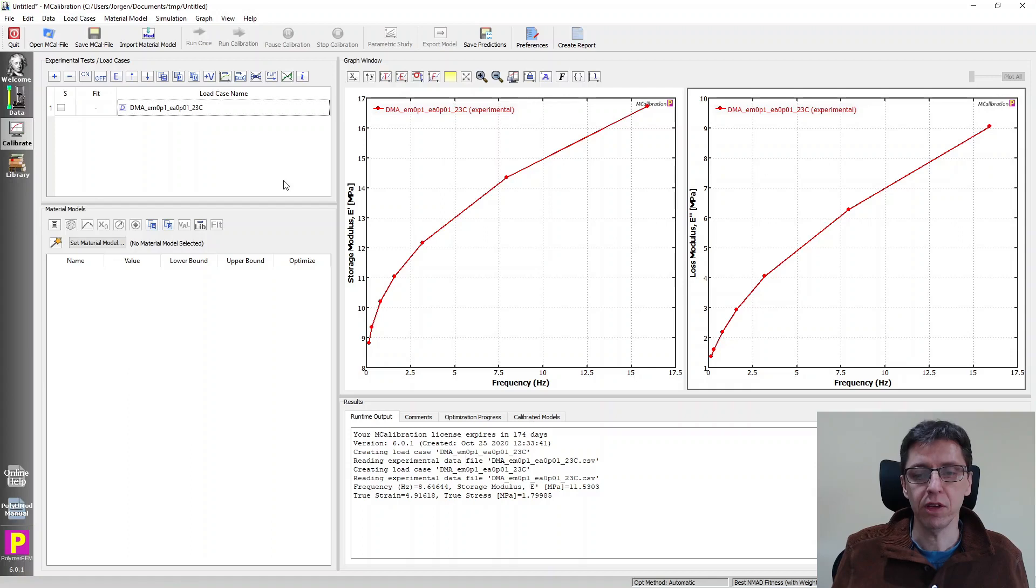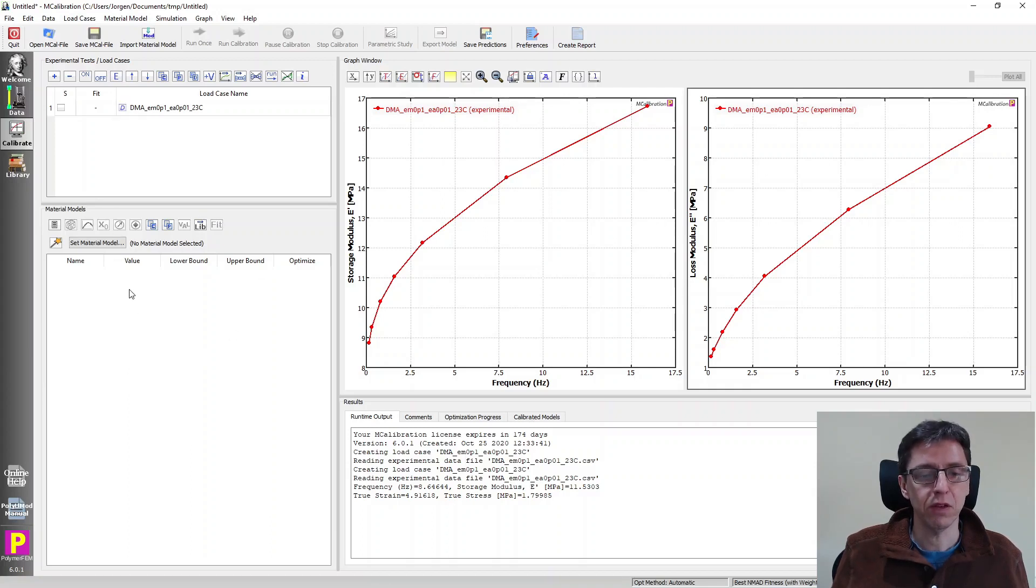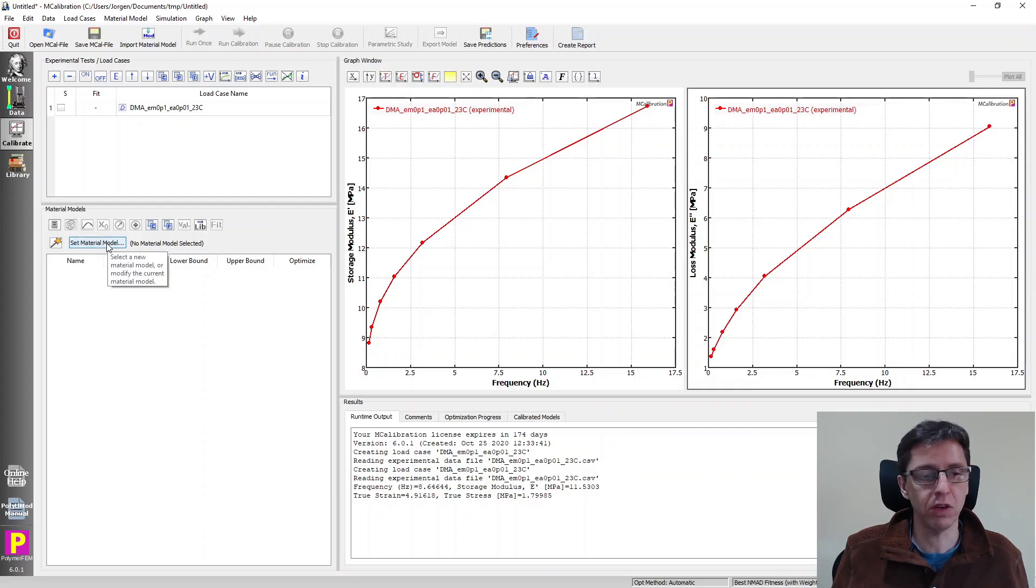Now let's see how we work with this data. So let me take a look at that. Well, we need to select the material model.